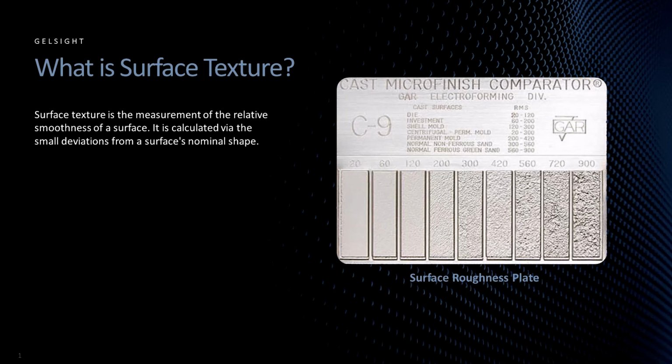We typically measure the surface texture to predict the performance of a component, but we may also measure a surface to help control the manufacturing process itself, because the machining process leaves a signature in the surface texture. Every surface has some form of texture that is a result of the way the surface was produced.